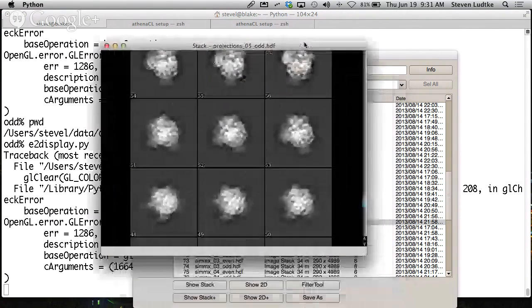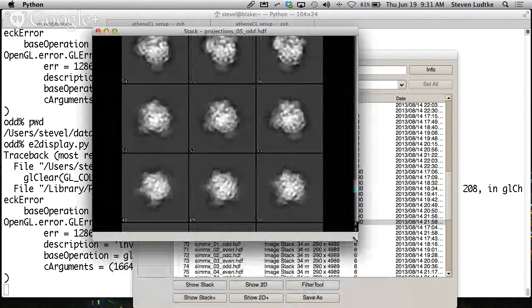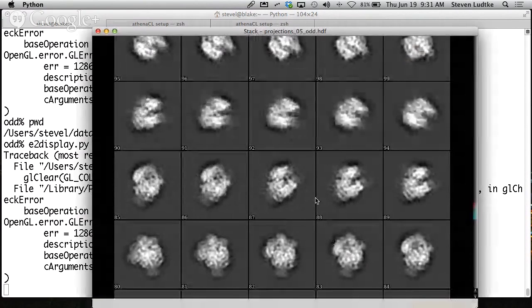Now, the problem that you get if you try and do it hierarchically is the fact that the appearance of the particle isn't necessarily uniquely related to the orientation of the particle. It's possible to have a particle in one orientation and another fairly distant orientation and actually look somewhat similar to each other. So in EMAN 1, we actually had an approach where we based it on geometry. We said, here's our unit sphere, we have projections represented as points on the unit sphere, and we just clustered them geometrically, by looking at points that were close to each other on the sphere, and then hierarchically classified things. It worked okay, but it never really worked very reliably, and we never used that for high-resolution refinement because it had some issues with it.